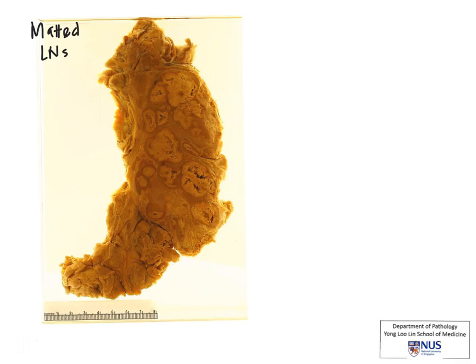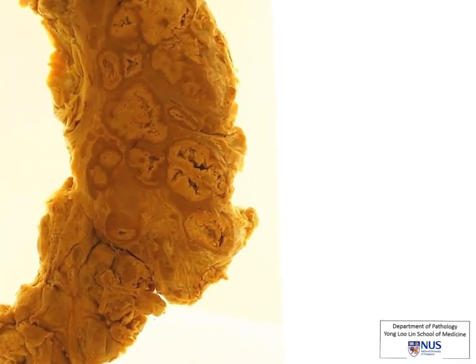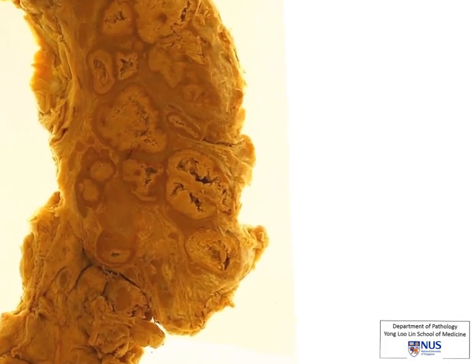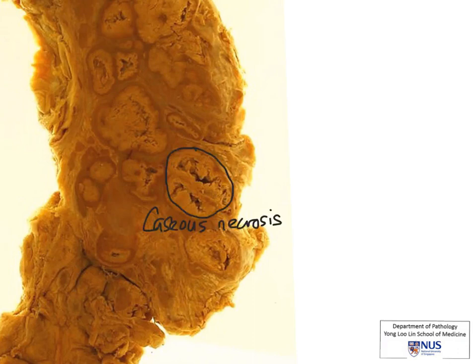Now let's take a closer look at the gross appearance. We can see that even within this nodal mass, there are some areas that show a different colour — here that I'm outlining, as well as here and here. They are paler, and there seem to be some areas of cavitation, showing that this area of tissue is very friable. This is the gross appearance of caseous necrosis, and this is one of the key features of tuberculous infection. Therefore, the diagnosis in this case is tuberculous lymphadenitis.